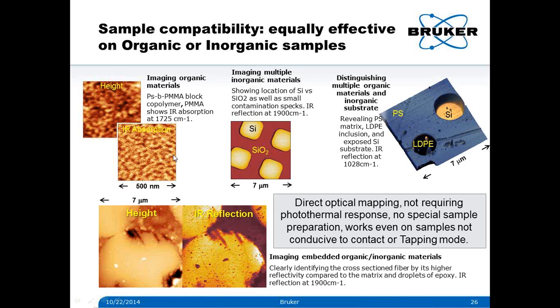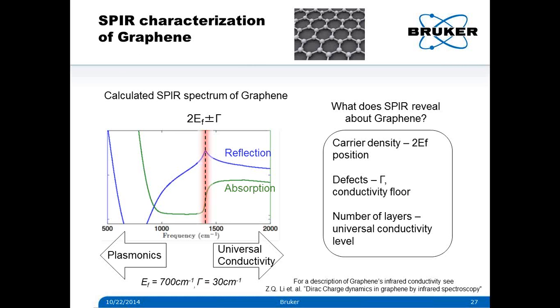And in contact mode, for example, this block copolymer would suffer a lot. You would just drag around these little guys here, and you would also blunt your tip on this test grating in contact mode with time, which is not the case if you use PeakForce Tapping. So the nice combination gives you more flexibility in what you can look at.